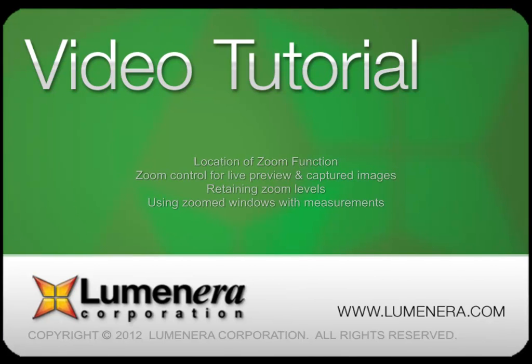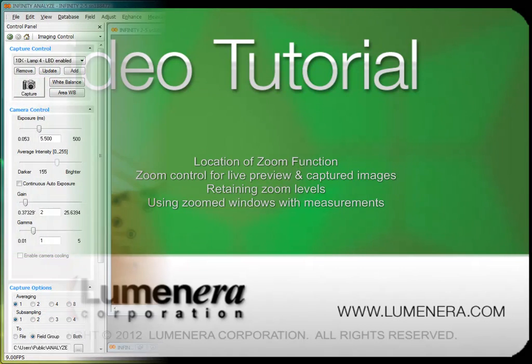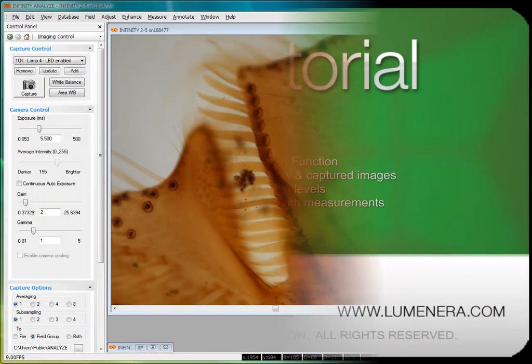In this tutorial, we'll go over the following steps: where to locate the zoom control, using the zoom control on the live preview and on captured images, how to set commonly used zoom levels, and how the zoom works while taking measurements.